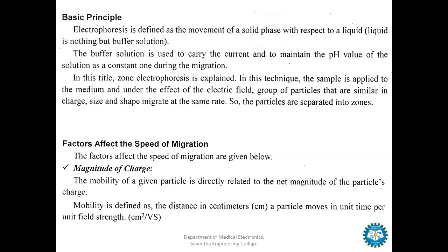The basic principle: electrophoresis is defined as the movement of a solid phase with respect to a liquid, that is nothing but a buffer solution. A buffer solution is used to carry the current and to maintain the pH value of the solution constant during the migration.